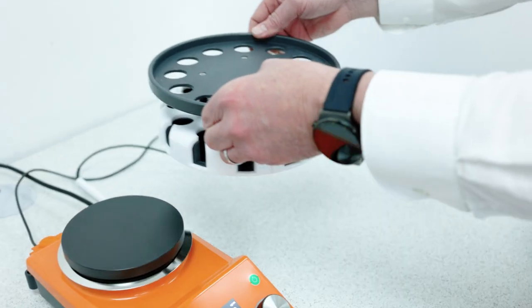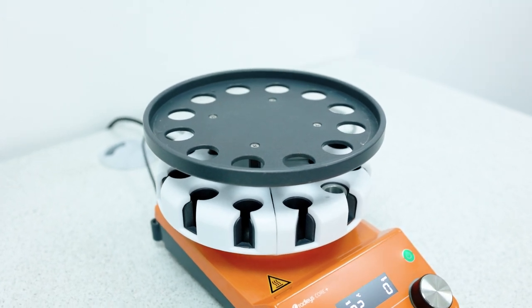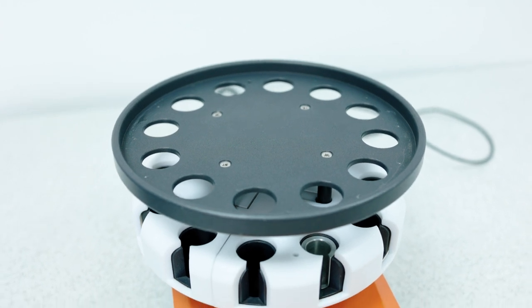We can locate the Carousel 12 base onto the 135mm hot plate, and its space-saving design of only 32cm by 23cm saves your valuable fume cupboard space. The base plate has efficient and uniform heat transfer because it's constructed from a single piece of aluminium.